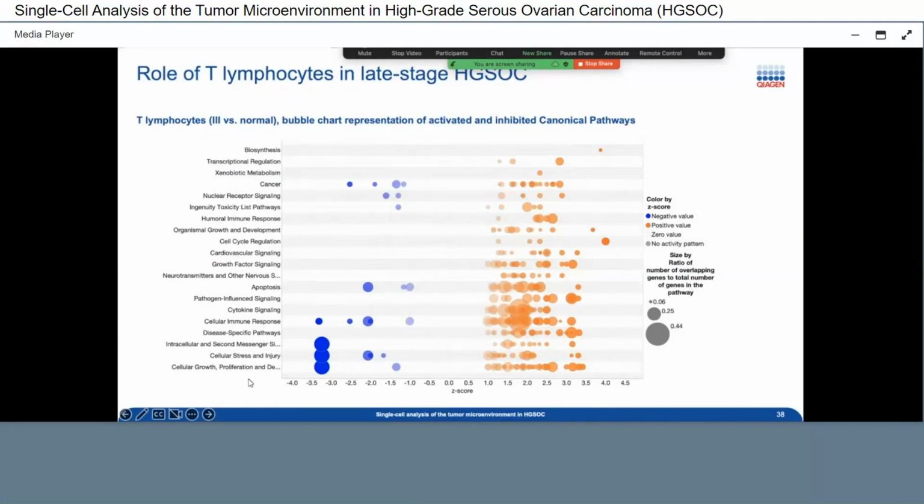I have the pathway category that we have in our IPA. We have over 750 canonical pathways already preset with different categories, as you can tell, growth factor category, cell cycle, nuclear receptor, and so on. And I put on the x-axis the Z-score. So basically, what you see here is orange and blue. First of all, on the left, it's blue: every pathway that is predicted to be inhibited. On the orange, every pathway that is predicted to be activated. But most importantly, the size also corresponds to the number of overlapping genes in that particular pathway that allows the calculation of the Z-score.